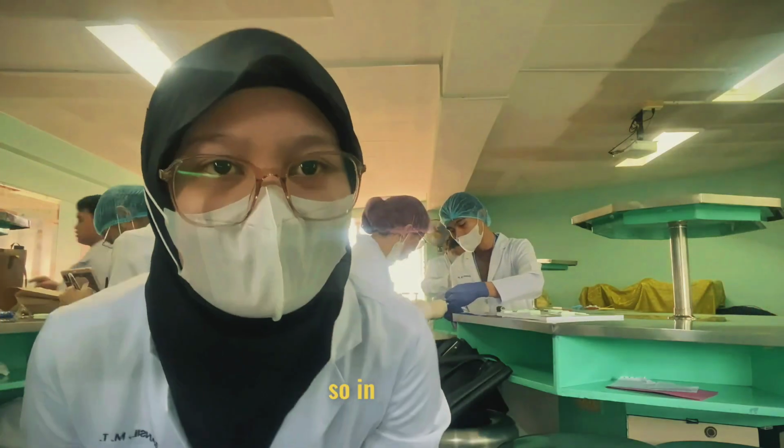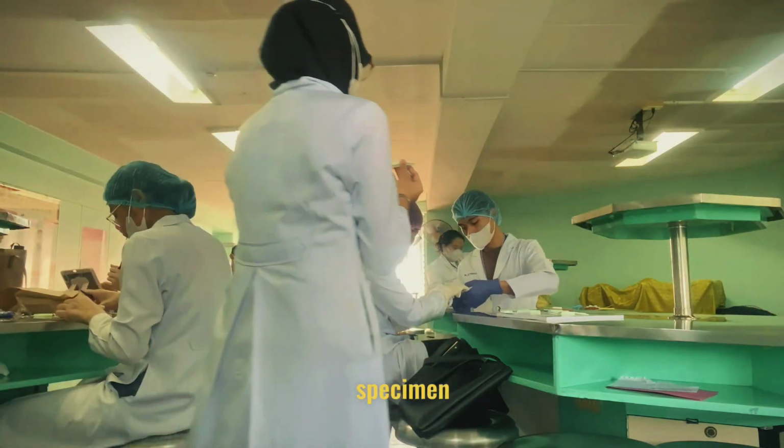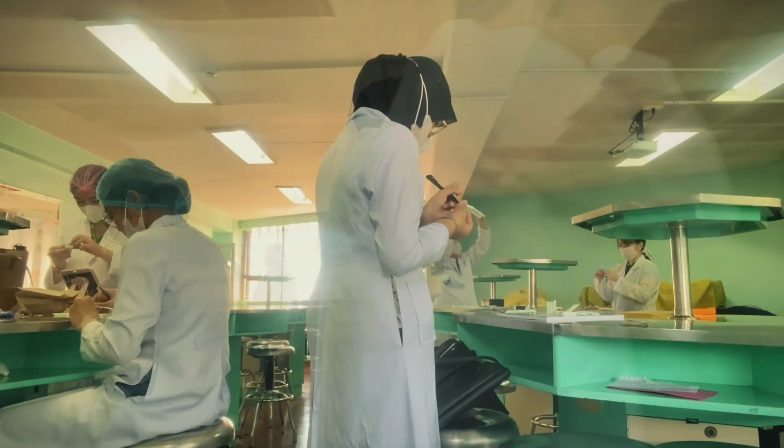Good day everyone! In this video, we will go through the complete process of histopathological specimen preparation, from labeling the tissue cassette to getting the slides ready for analysis.